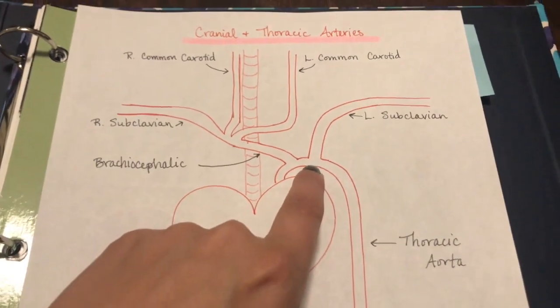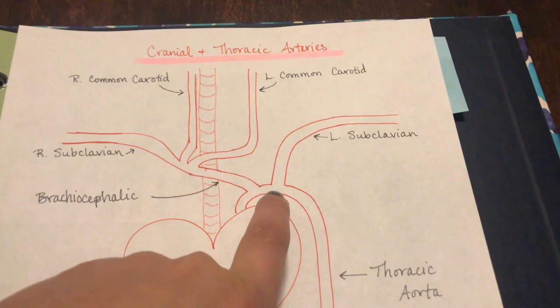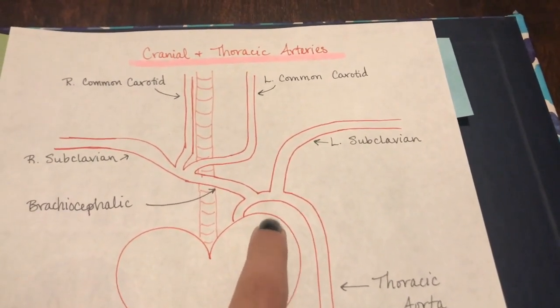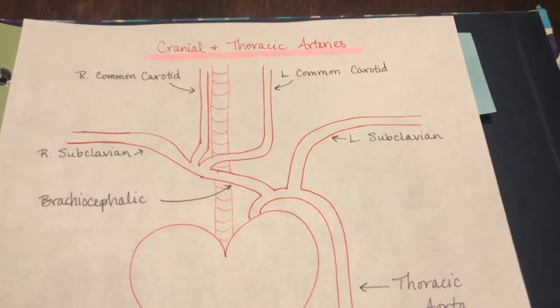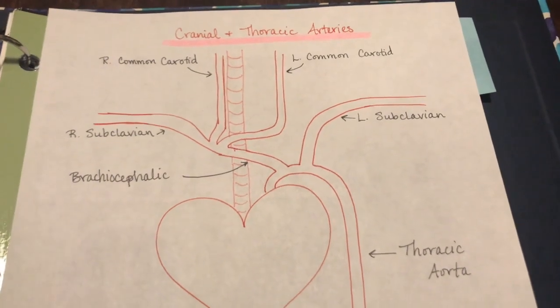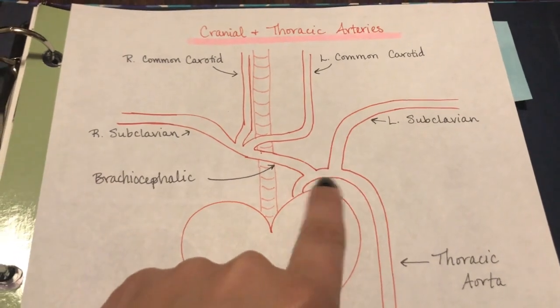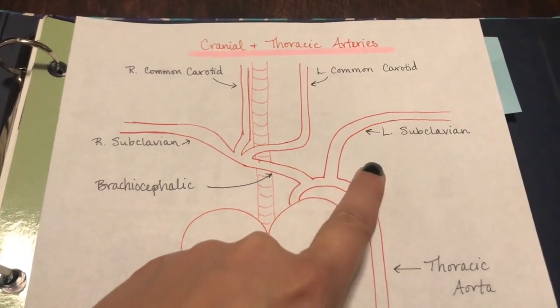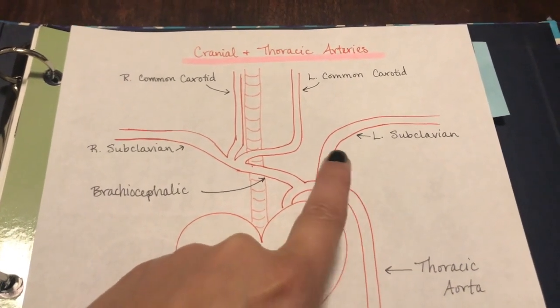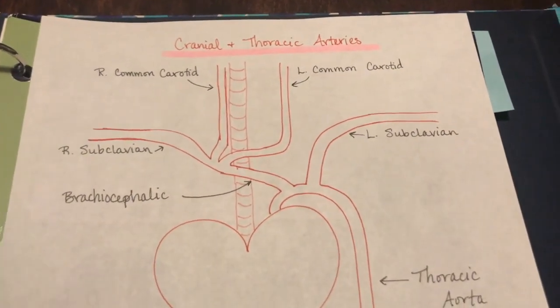Then the first branch coming off of that aorta is the left subclavian artery. I was about to say vein, but it's the left subclavian artery. So it's going to be one of the two projections coming off of this aortic arch in the Mink. So in the human heart, or off of the human aorta, we'd have three branches, but here in the Mink, we only have the two. So the first one, again, left subclavian artery, running up to the axillary region or the armpit and heading out under the left arm of the Mink.